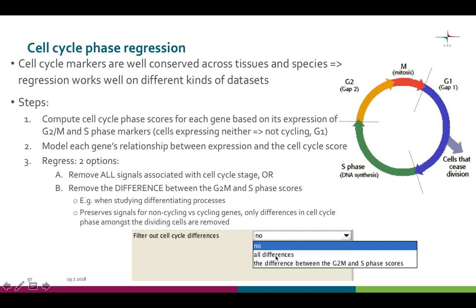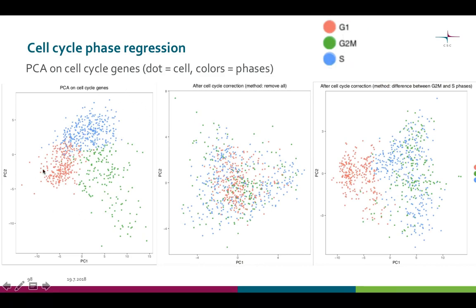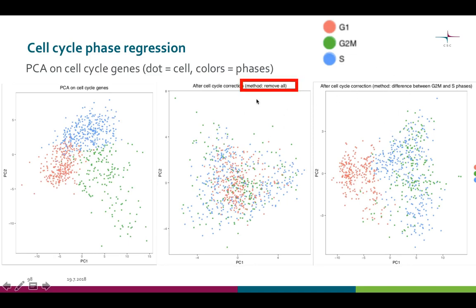When running the tool with the cell cycle regression option on, you will get two extra PC plots. In these plots, each dot is a cell and they are colored based on how they are scored to the different cell stages. Only the cell cycle genes are used for the PCA. In this example, you can see that the first plot shows clear separation according to the cell stage. The second plot will show the same cells after the regression of your choice — either where all cell cycle associated differences were removed, or where only the difference between G2M and S were removed.